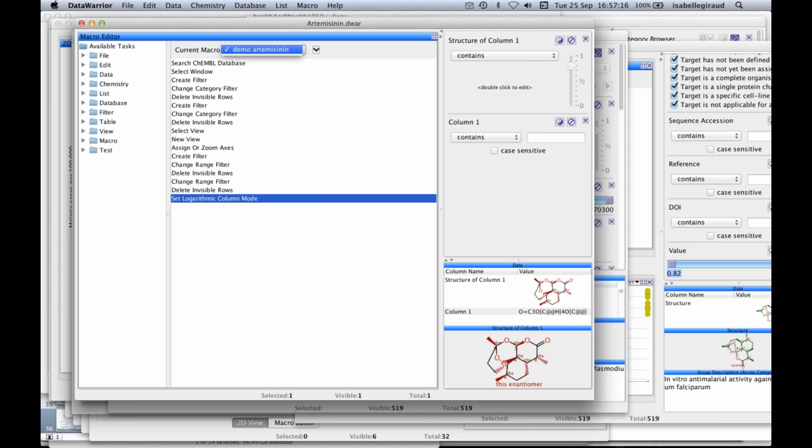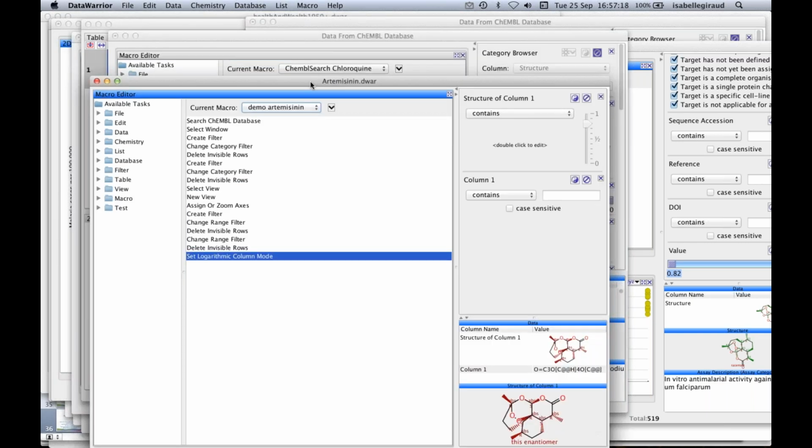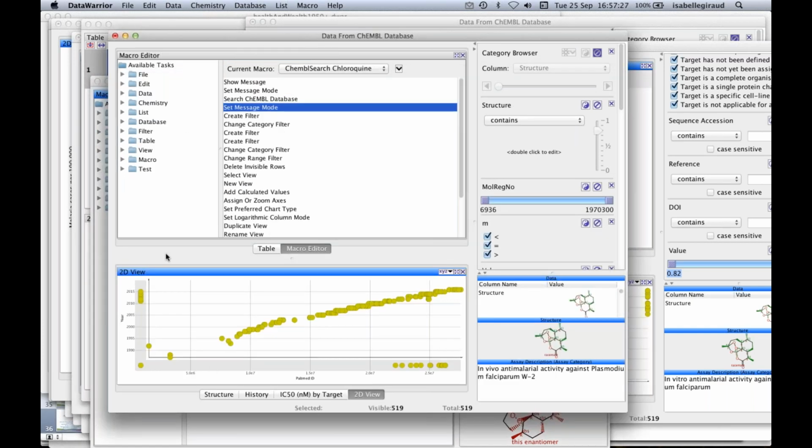The SAR can also be included in your file as a macro, as Mark said. I think it's really convenient when you want to make some changes. Sometimes you prepare an SAR and then you think, oh, now the scaffold is too restrictive, I want to change it a bit, and you have to start all over from the beginning. If it is located in a macro, then you can just apply this small change and let it run again. So it's a very flexible way of working.